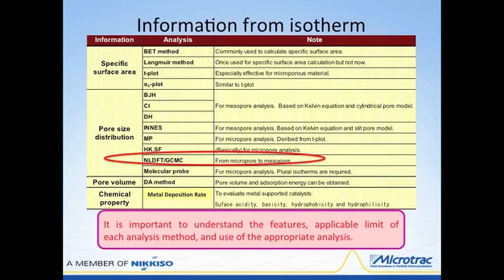The information that you can get from isotherms is based upon the calculations that are performed. And over here we have the type of information a user would want. You can get the BET method. You can use Langmuir if that's desirable. T-Plot can be very readily calculated, and this is very effective in determining whether micropores or even mesopores are present in the sample. If we go beyond just looking at specific surface area, we can look at pore size distribution, and there are a multitude of calculations that are available.